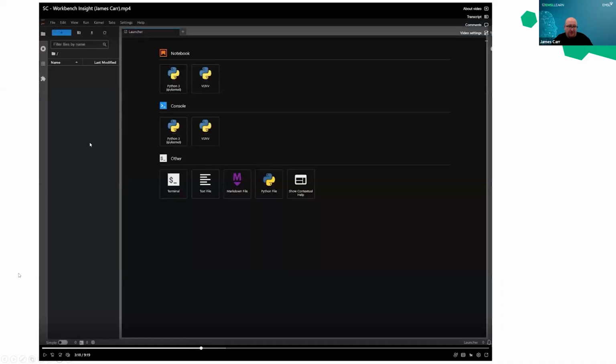And when you go into the Explore module, it will take a second to start up, but it's very fast, and you'll be presented with a screen that kind of looks like this. So from here, we have the data that we downloaded from the data portal, and we want to upload it, and it'll appear there on the left pane. That's kind of your working folder.